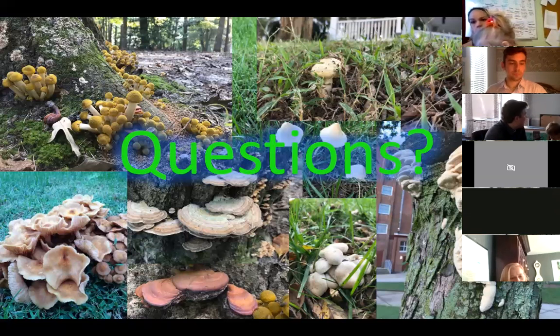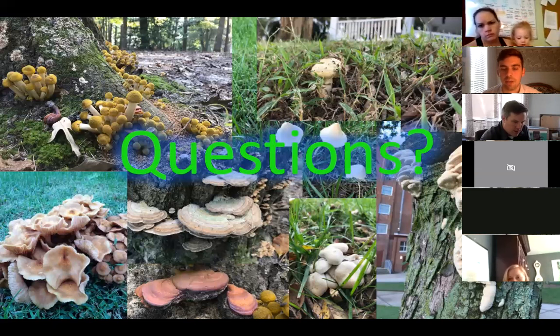I guess I have two questions. First of all, what did you amplify? Good question. We amplified these different regions of DNA by PCR. On the DNA, it's expressing these different ribosomes, and we're isolating part of those ribosomal subunits through PCR. We're amplifying just certain genetic markers within those subunits. For 16S, we're using one variable region in that subunit. For ITS, that's the internal transcribed spacer, but it's in fact an amplicon product. You have to amplify that from genomic DNA.